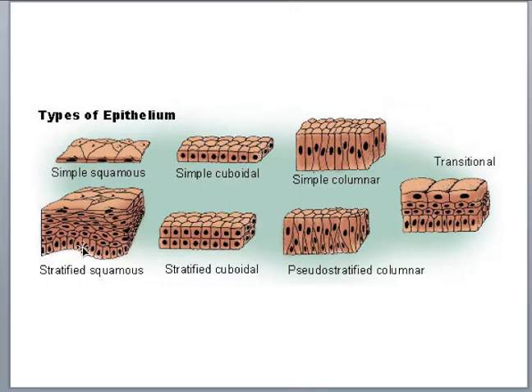Stratified, so down here showing you stratified squamous epithelium. So stratified because there's multiple layers, but if you look up towards this free apical space, they're very flattened and squished, irregularly shaped, so stratified squamous. Here, you will not have to identify stratified cuboidal, but it does exist in the human body, usually in very large glands. But for our identification purposes, you'll only have to identify a simple cuboidal tissue type. Okay? But stratified cuboidal means you have multiple layers of cuboidal-shaped cells.